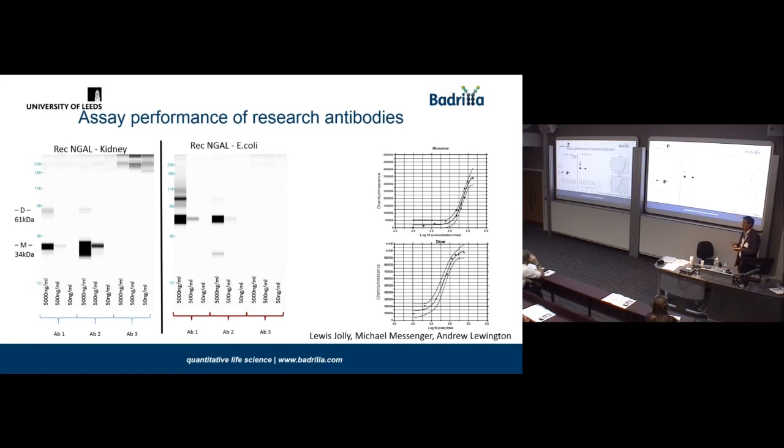So here are antibodies. It's the same protein. One is a monomer, one is a homodimer, and yet the antibodies are able to bind with different affinity to those different species. That can only be determined by very careful consideration of standards of this type. So, in my view, this allows us to really get to know the qualities of the assay that our antibody achieves, and it would allow us, if we wanted to compare, as a manufacturer, the performance of one batch of this antibody to the next one that's been prepared, to demonstrate to our satisfaction that it is equivalent batch to batch.